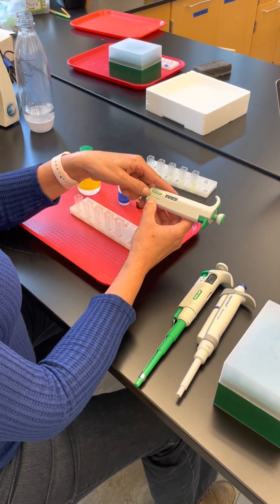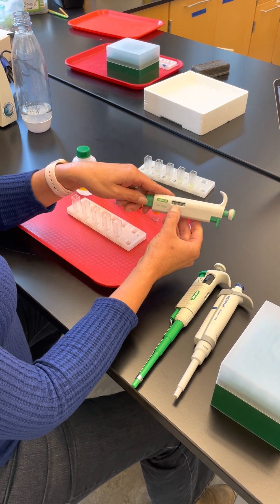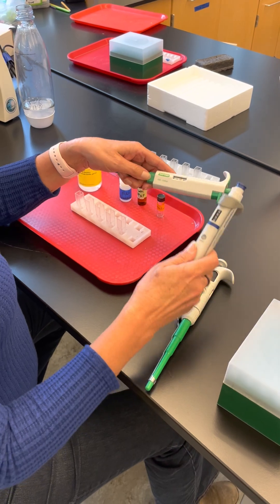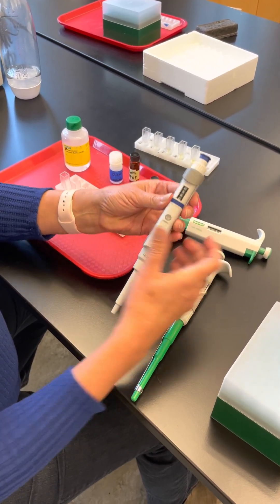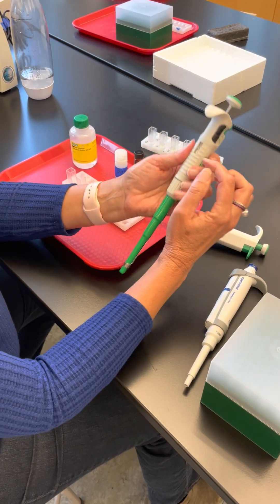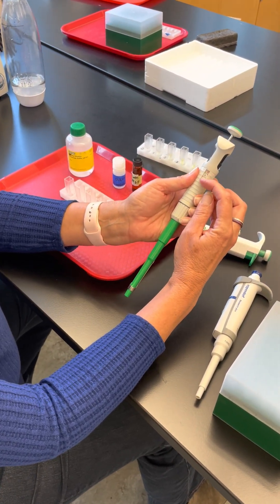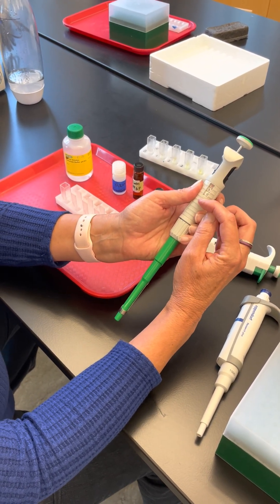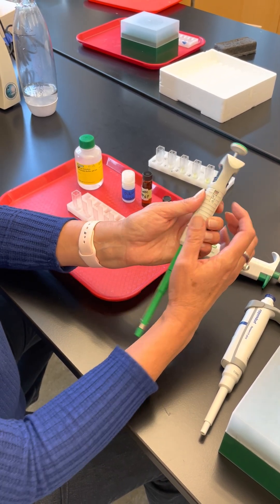We're going to use this micropipette that measures between 100 and 1,000 microliters — this one is set to 500 microliters. Some micropipettes don't have a ones unit, so you'll only see three digits. For example, five-zero with a missing ones place still means 500 microliters.